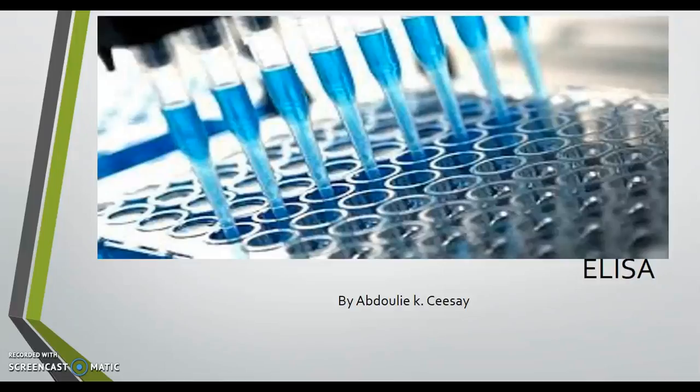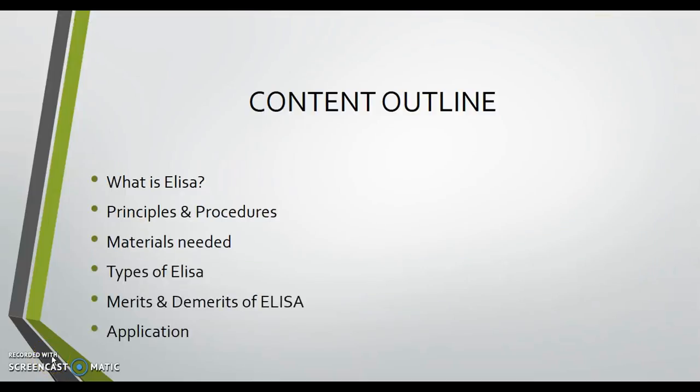Hello there. Today I will be explaining about ELISA. In the slides to come, I will be talking about ELISA, the procedures, the materials required, the types of ELISA, the advantages, and also the applications as well.